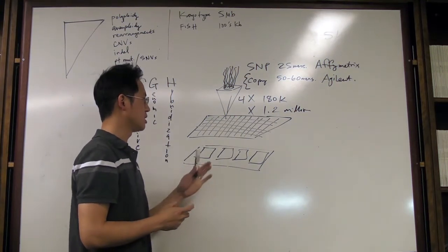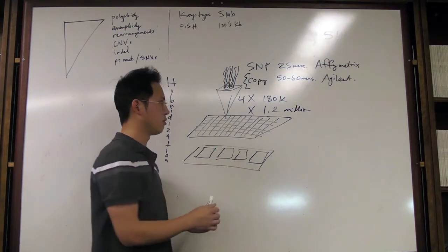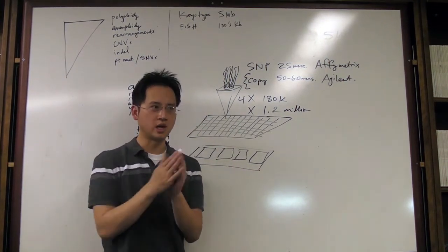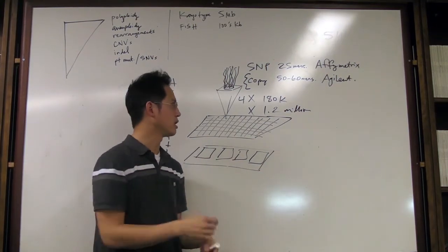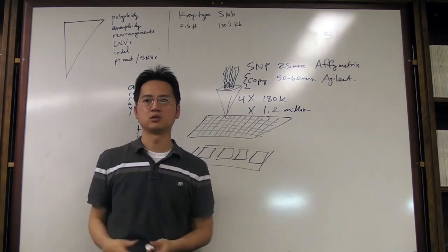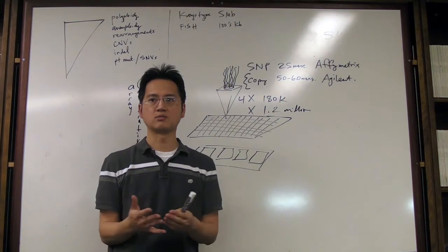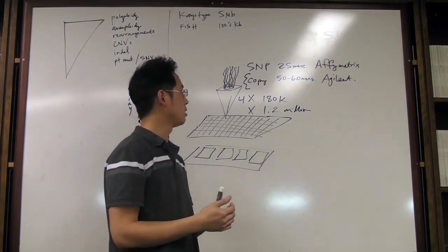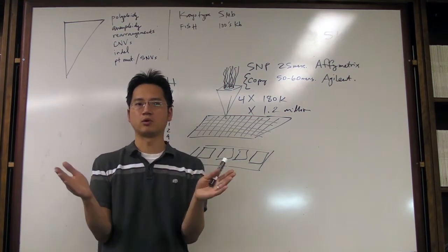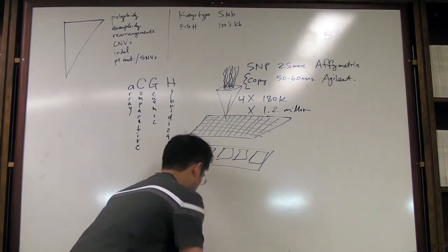And arguably it's the most complex assay that we run because essentially you could design this to cover the entire genome in intervals. You're not really covering every base in the genome. You're covering maybe every 10,000 bases. There's a probe that hangs around to do copy number. So the resolution is not going to be down to hundreds of bases or 1,000 bases. It's really going to be dependent on the minimum call that we make and how many probes cover and how well spaced they are. So that's the array component.